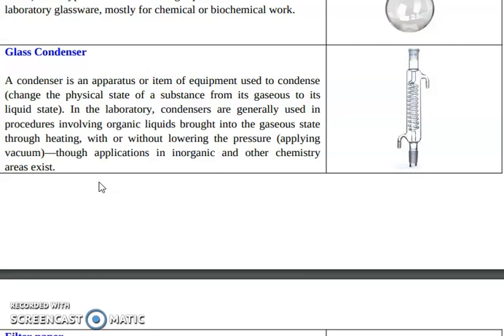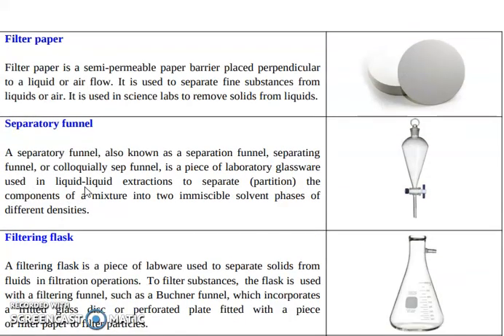In the laboratory, condensers are commonly used in procedures involving organic liquids brought into the gaseous state through heating, with or without lowering the pressure by applying vacuum.